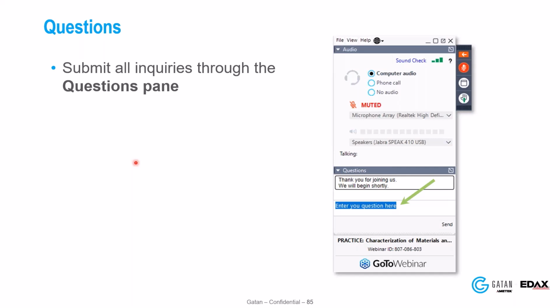For us, we've had dictionary indexing in OIM Analysis for maybe five years, and we used it periodically, but it was so slow. You had to have the right problem to decide to do it. But now with spherical indexing, we've been running it for probably a year and a half internally as we've developed and tested it. And now we're always on our little Teams chat sending each other examples of, can you believe this?